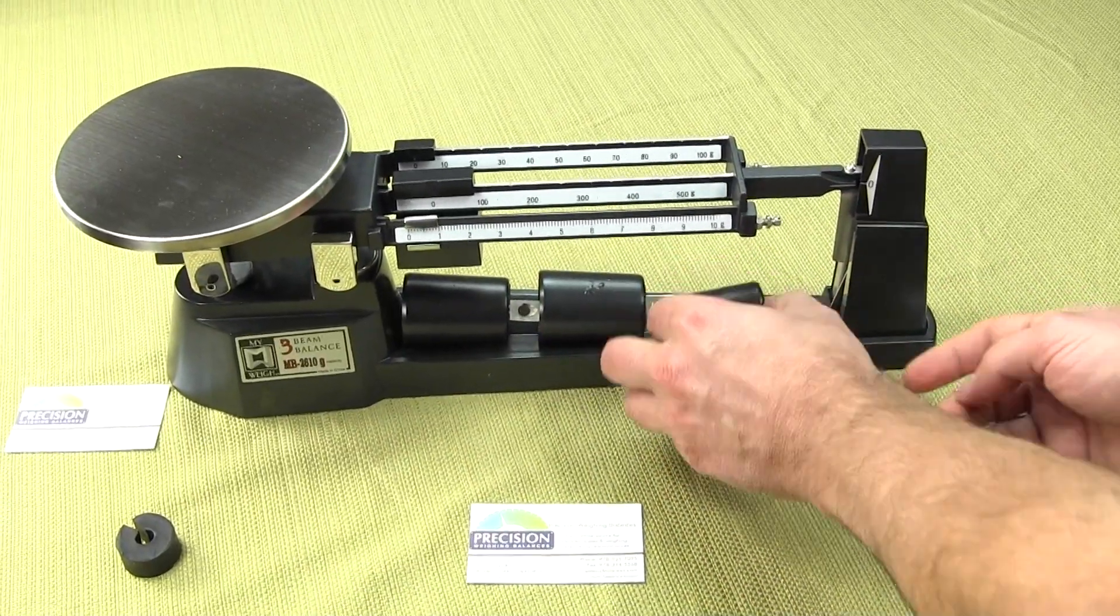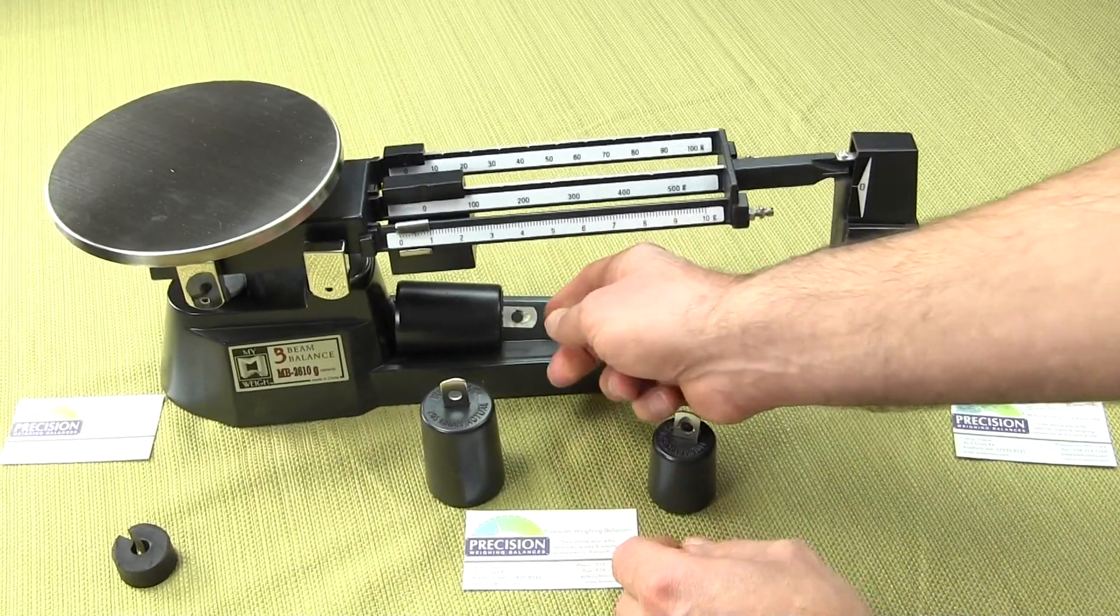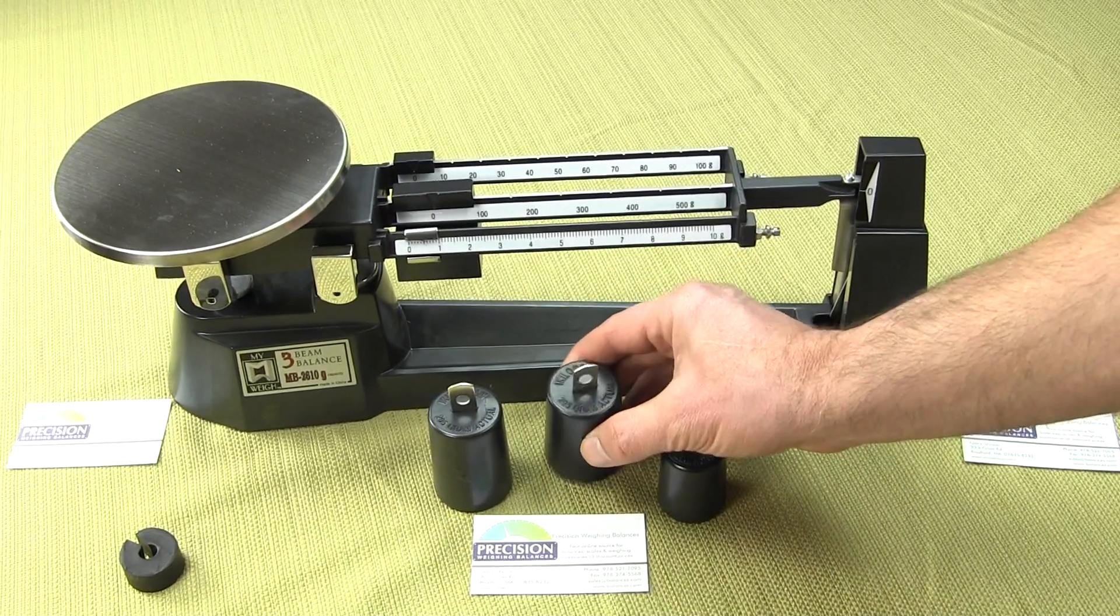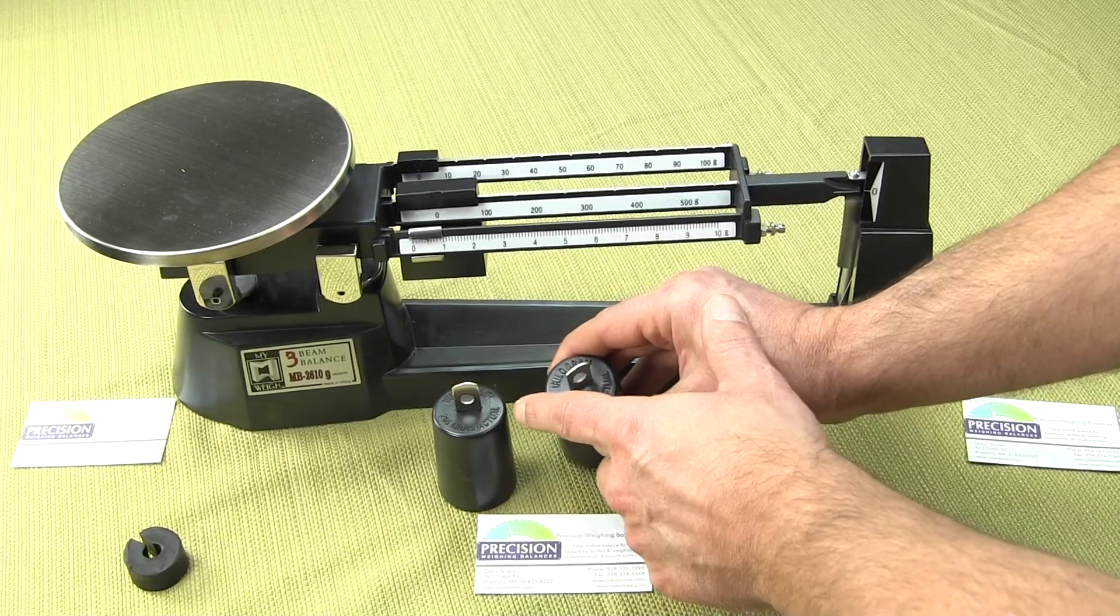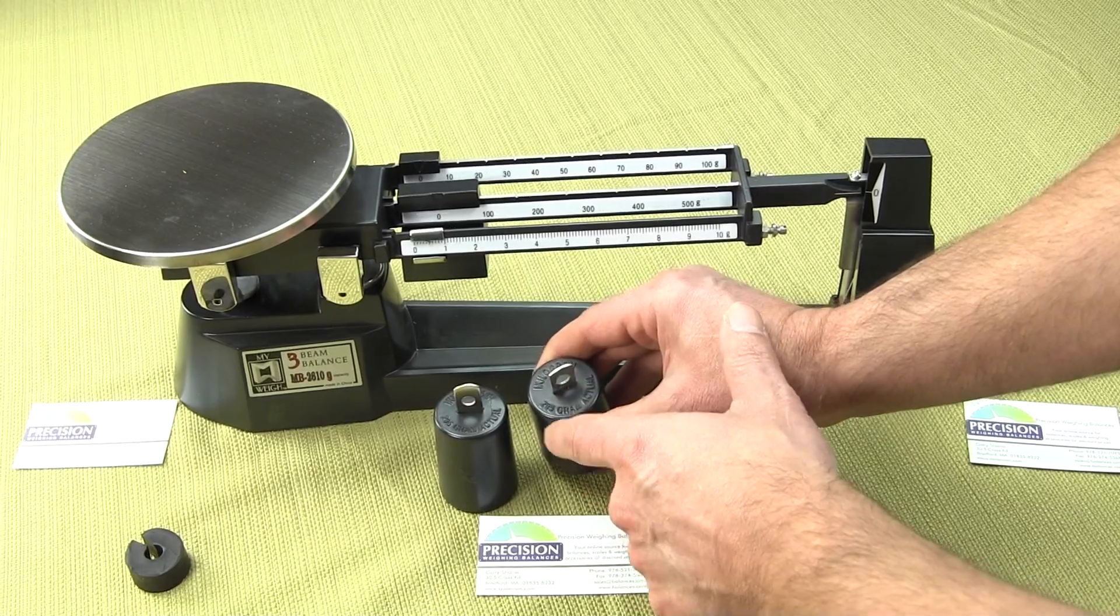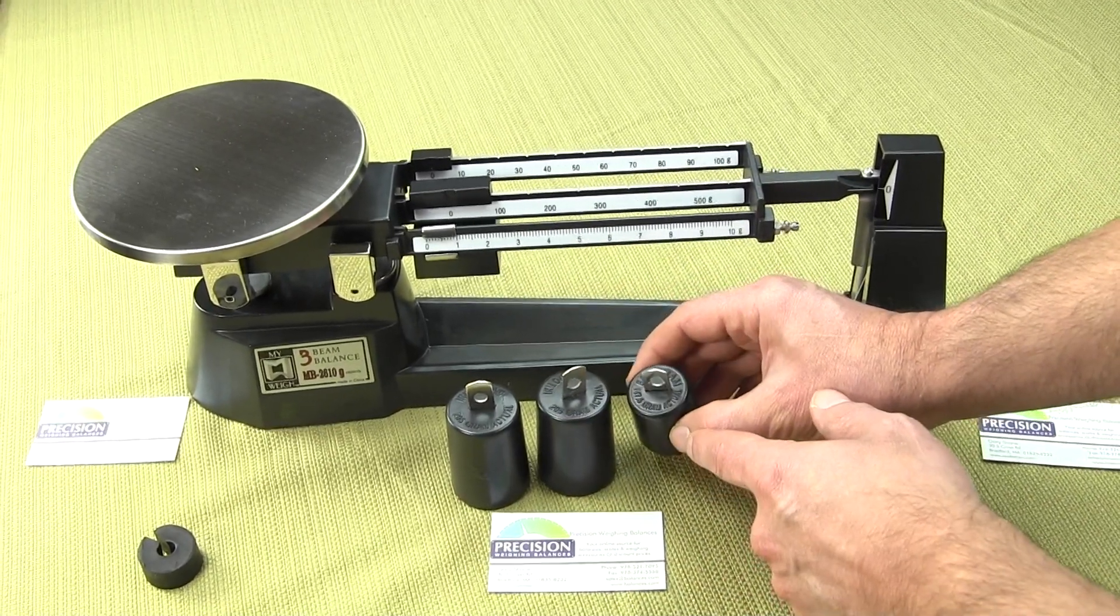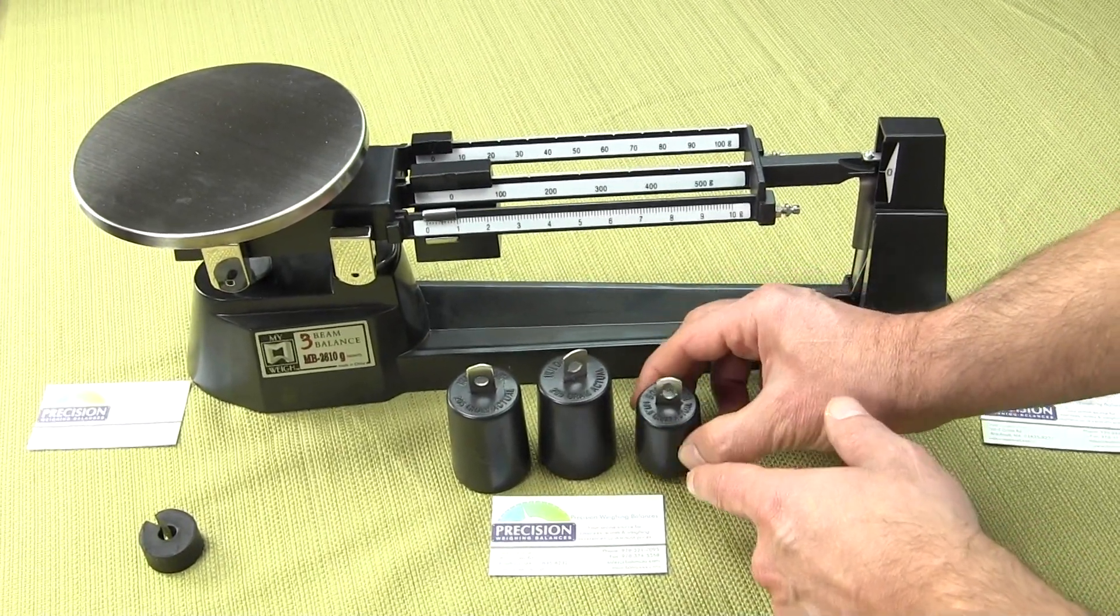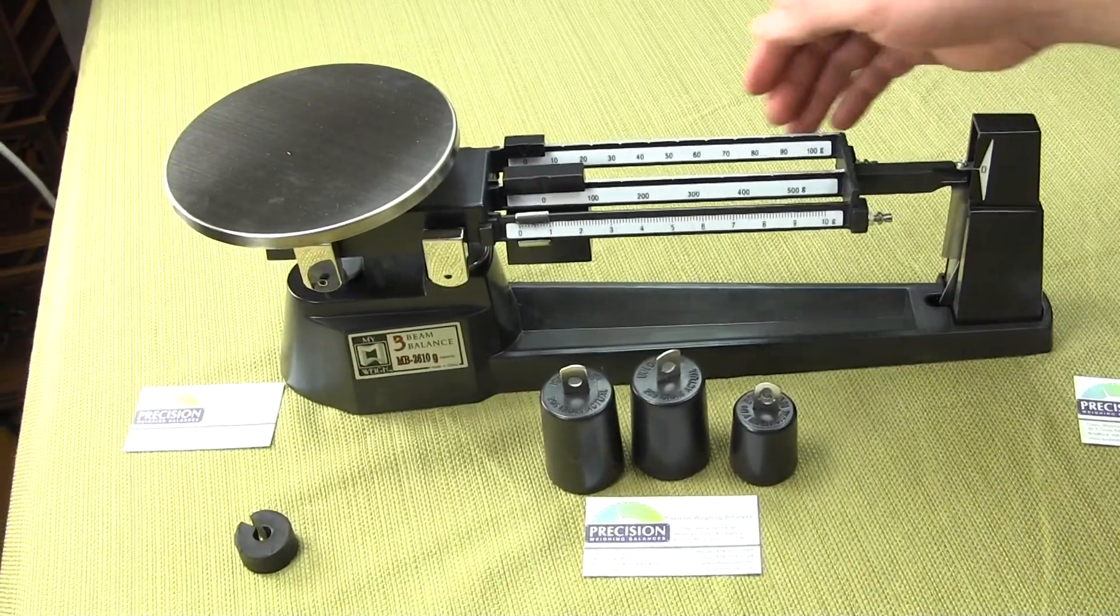You get two 1,000 gram and one 500. Now these attachment weights do not actually weigh 1,000 grams. They're printed on the top that the 1,000 gram weighs 295, so the actual weight of this mass is 295 grams. On the 500 gram weight, the actual weight is 147.5.